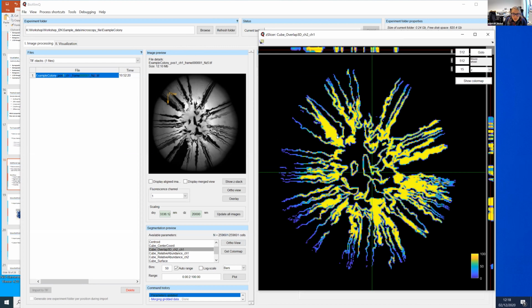For example, take this area here. This is an area where we have green and red mixed very tightly together. And we're not really able to resolve this with a thresholding because the channels kind of leak into each other, or it looks a little bit like leakage. It's not actually that, but you can think of it intuitively as that. Even in the first channel, even if there's no cell here in this channel, the intensity doesn't go all the way down to 0. It's more of a gray, and this is why we can't really get rid of it.